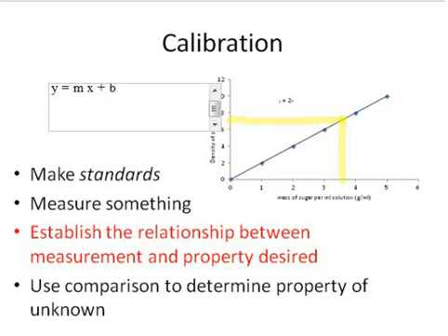I should point out that this procedure that I've shown with the lines, extracting a y value to the curve itself and going down to the x-axis, can be done mathematically by using this equation and basically plugging in the known y value, the measurement of the density of the Coke, and solving for x.